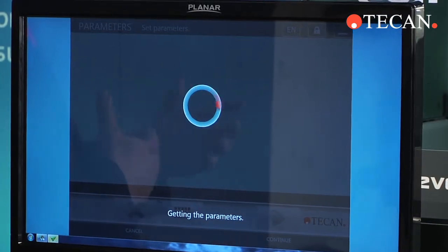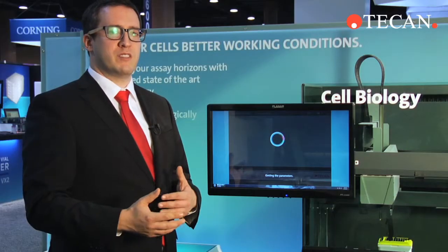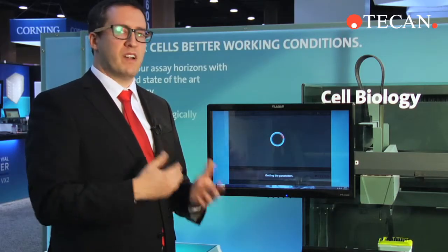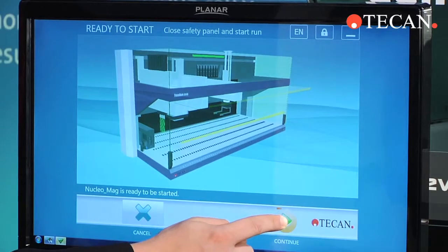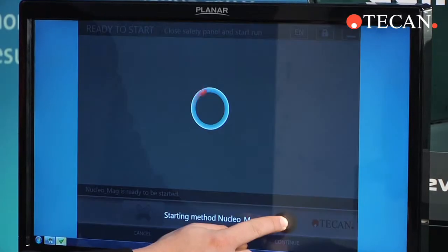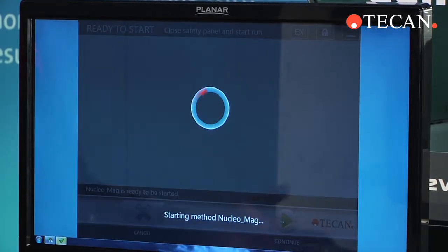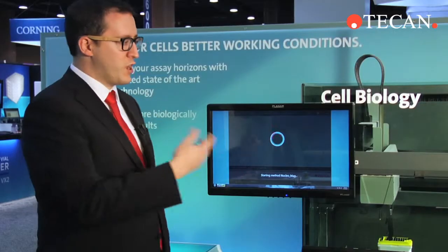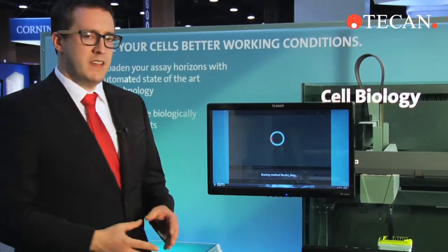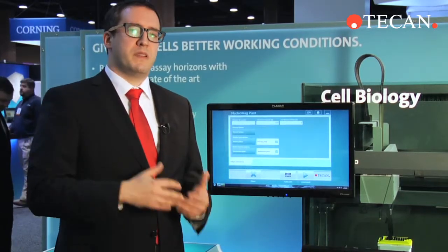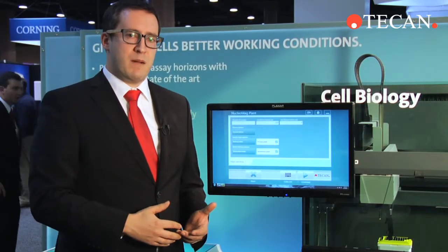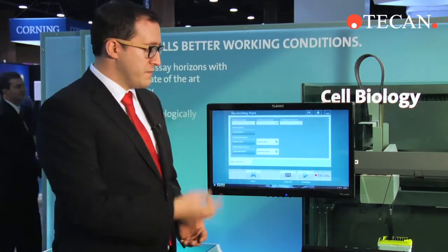The idea is that new operators can walk up and be very quickly trained. To start any instrument run, a simple press and hold will start the runs off, and the software gives you the ability to completely customize the operator interface.